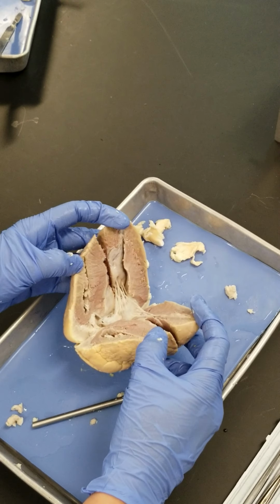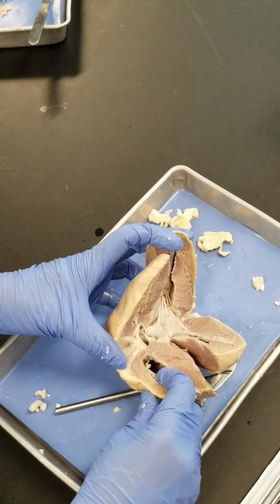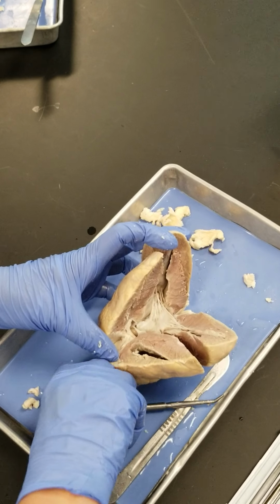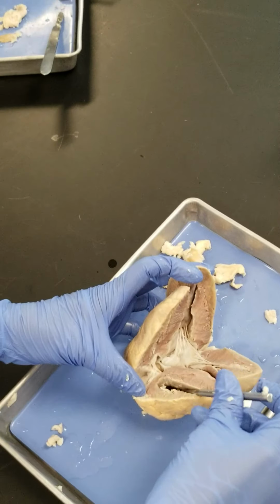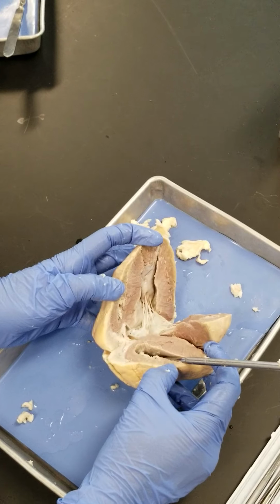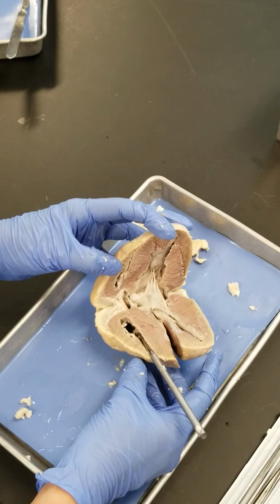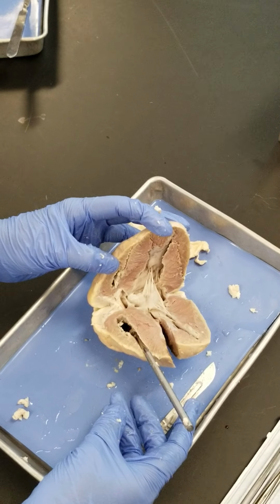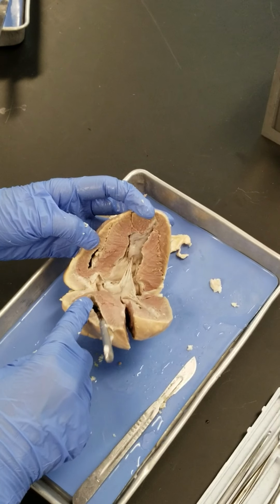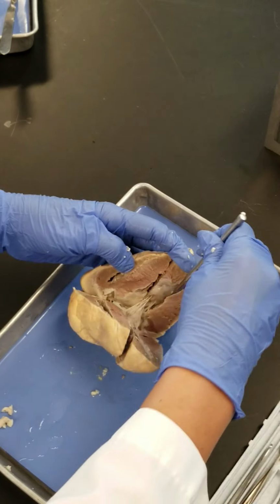You open the heart, and the first thing that you search for is the thickness of the wall. This is thinner than this one. Therefore, you just go through all the things backward. What chamber is this one? I put a pin here and ask you what chamber this one is. Right ventricle. Everybody agrees? Which chamber? Right ventricle. What about this one? Left. Left, like if I put it here.